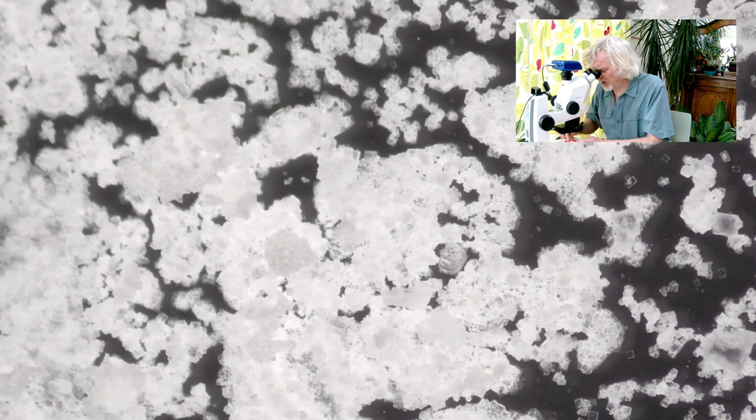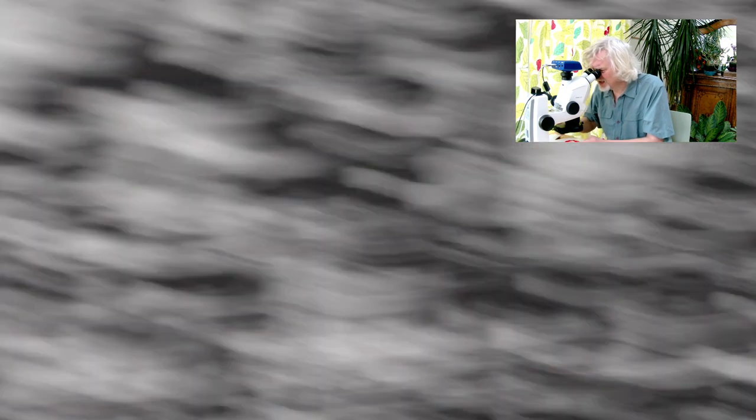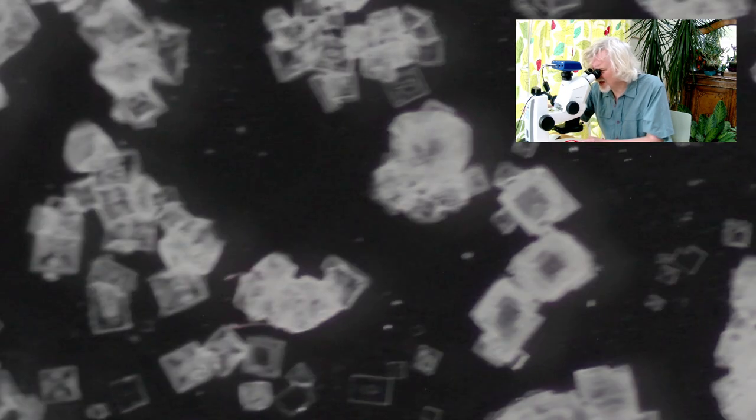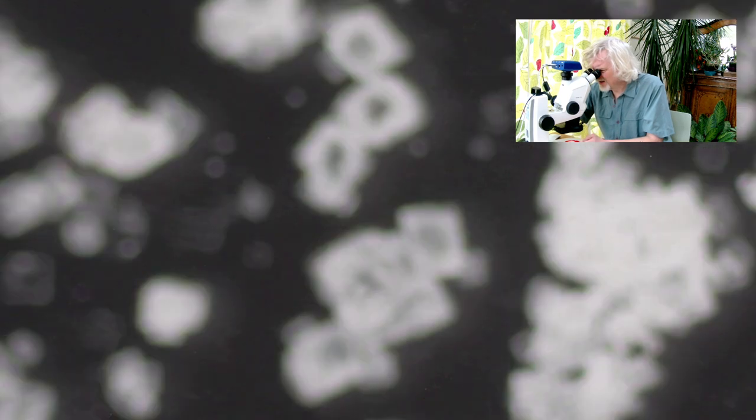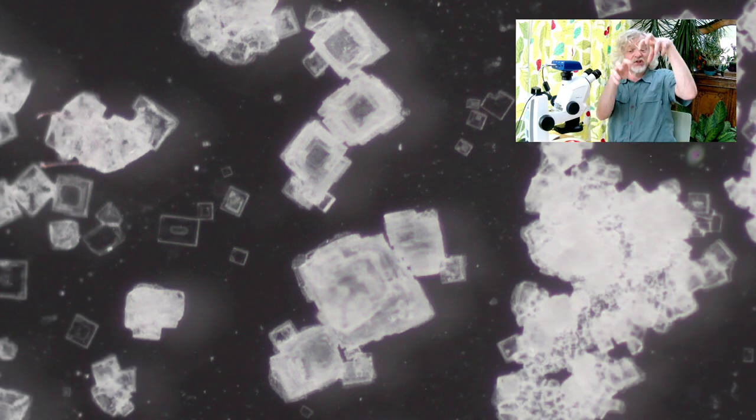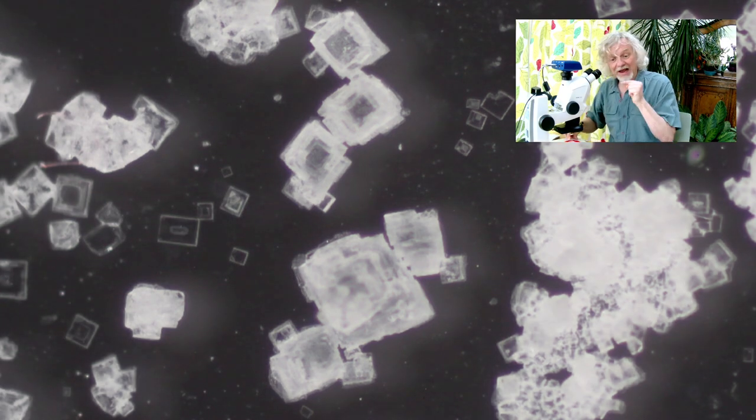And then as you go further out, it becomes more jumbled and more difficult to see what's going on. But this bit in the middle here is quite nice. I'll zoom in on that. There's some nice big crystals there that have grown. I quite like these ones here. This little series of three here. They're quite nice. They're all like little cubes stacked on top of cubes. So that's salt.